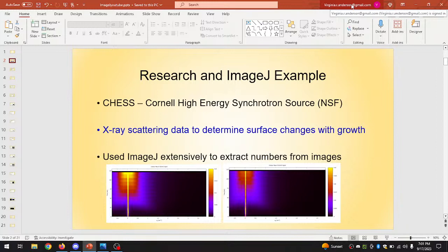And even though I don't plan to do a full tutorial on exactly what I was doing with these, I want to mention that the power of ImageJ is that you can grab all kinds of data, all kinds of statistics with an open source software. So ImageJ really helped me out, and I love open source software. So I wanted to explain another use for it that a lot of people that I know have done, which is even to try to use it to analyze particles, and also to just tell you how to get it.